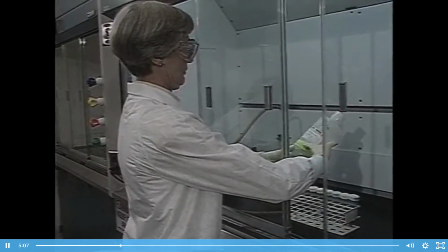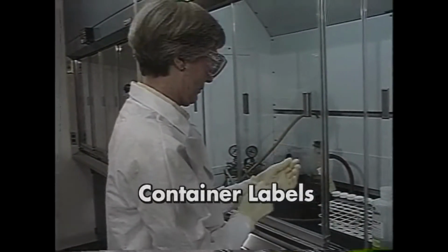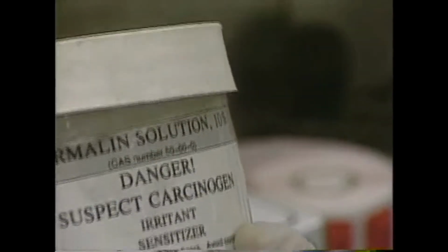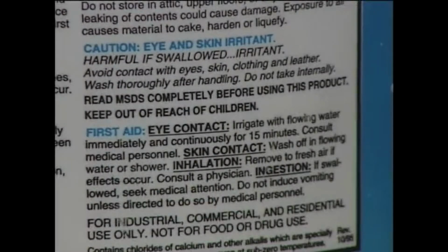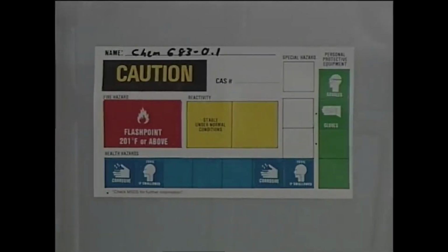Another source of hazard information in your lab is the chemical's container labels. Remember to read the container label before working with any chemical. This label identifies the chemical, its primary hazards, and any required safety precautions. Like MSDSs, all labels do not present information in the same way. Some labels are written. Others use shapes, numbers, or letters as warnings. There are also labels that use symbols or pictures to represent hazards or required personal protective equipment.